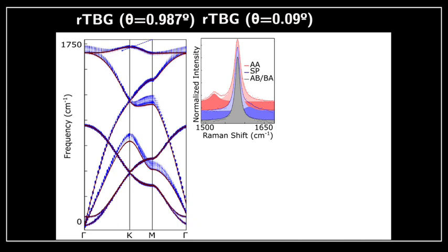Now I have to attract your attention to one important aspect: experimentally the frequencies are a little bit lower than theoretically because of the model. The model is not completely quantitative, but in all transparency, I have to say that.